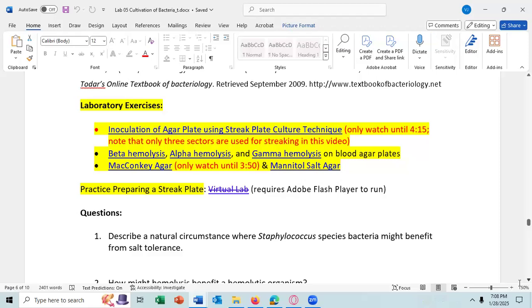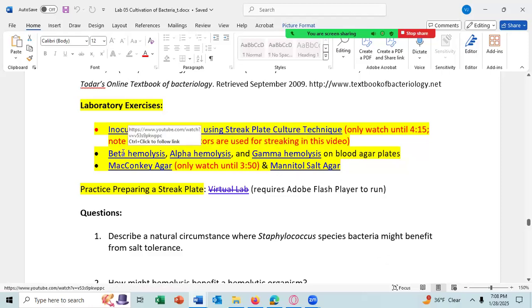You also need to view the videos to see what's going on in the videos. In the first video we have a video on inoculation of an agar plate using the streak plate culture technique, meaning we're streaking for colony isolation. In this video, you only need to watch it up until 4 minutes and 15 seconds.